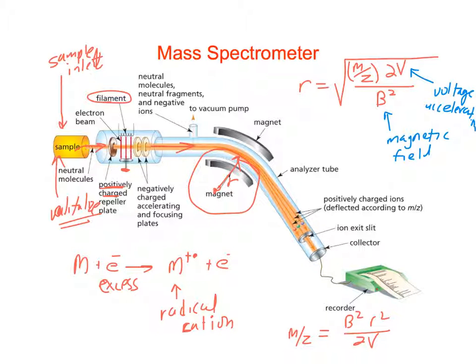See, they have different ions shown in this drawing. Some are going off to the side and are not measured, but as we scan through the voltage, essentially this beam bends over, and at some combination, each ion will go through the exit slit and be measured.